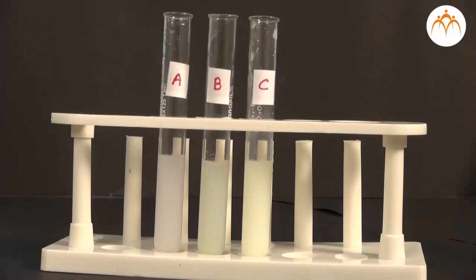In test tube A, the precipitate formed is white in color. In test tube B, the precipitate formed is light yellow in color. In test tube C, the precipitate formed is dark yellow in color.